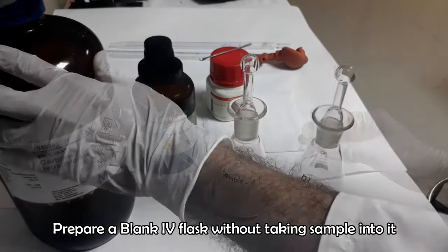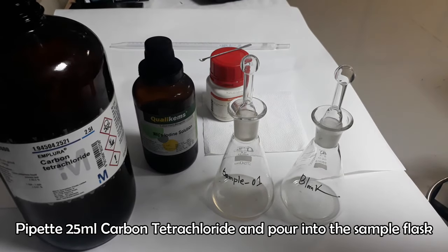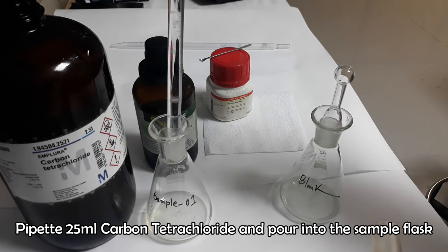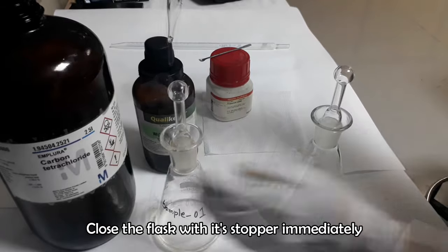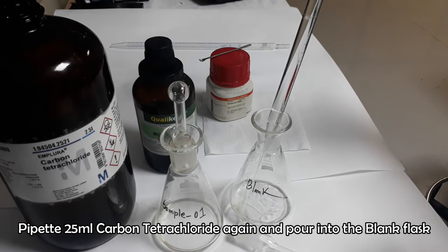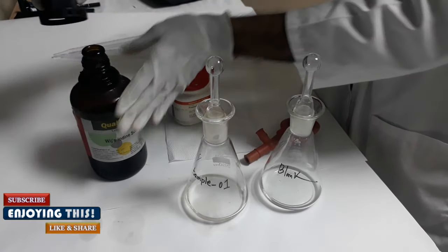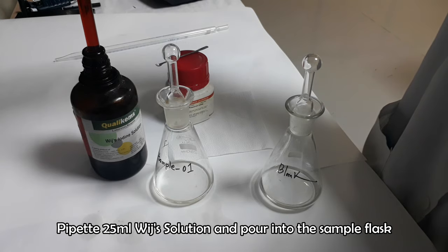Prepare a blank flask without taking sample into it. Pipette 25 ml carbon tetrachloride, pour into the sample flask and close the flask with its lid immediately. Pipette another 25 ml into the blank flask and close it with the lid. Add 25 ml Wijs solution into both flasks and close them with the lids.